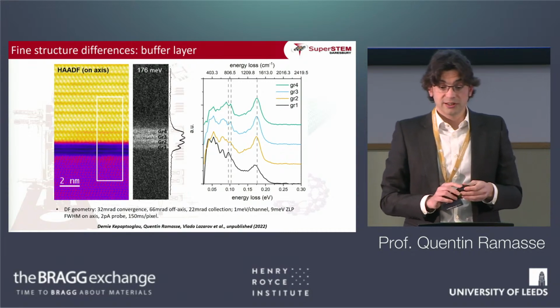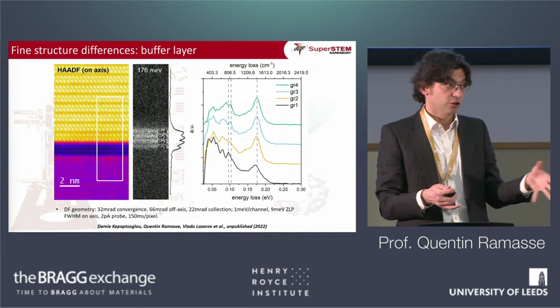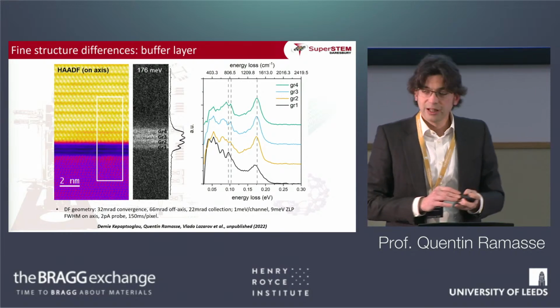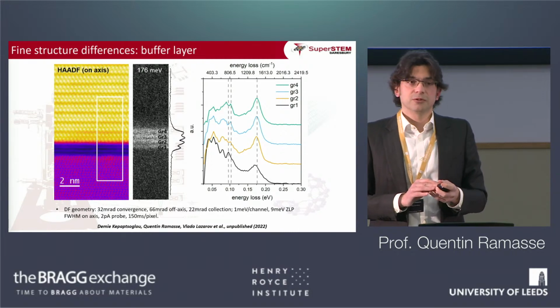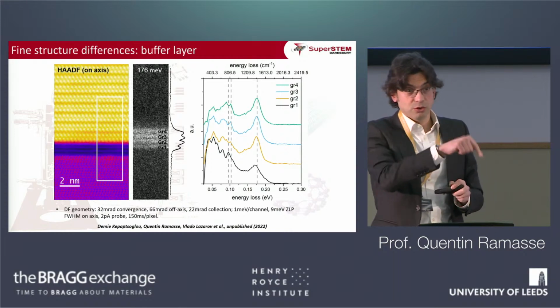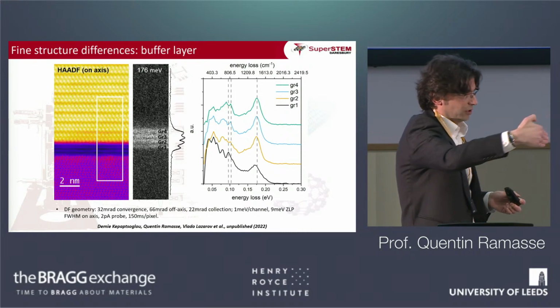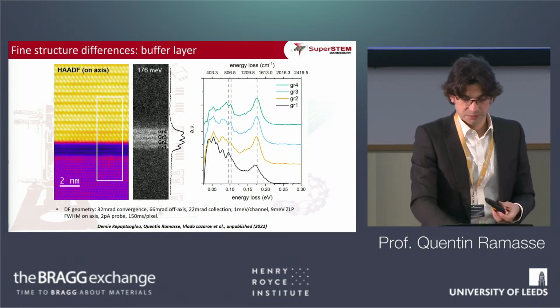And we're particularly excited by this because you've really just put everything together with that one atomic probe. Take that one step further, and if I can dream a little bit before I stop talking, carbon-13 and carbon-12 also have different vibrational responses, different modes, so you might actually also be able to map your isotopic vibrational response plane by plane, depending whether you have a layer of carbon-12 and a layer of carbon-13, and add defects and map all this at the atomic scale.